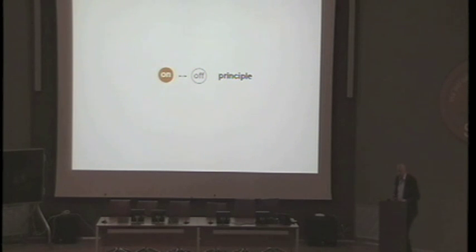Okay. Now, with that, I'm coming to the last part of my talk, which is to give a general outlook of the development. As I said, you will understand the whole development only if you understand the principle. And the principle behind this game of overcoming the diffraction barrier is what I'm calling the on-off principle. You've seen it. Turn things off to see only that one, and then later you turn the other one off and see the other one.